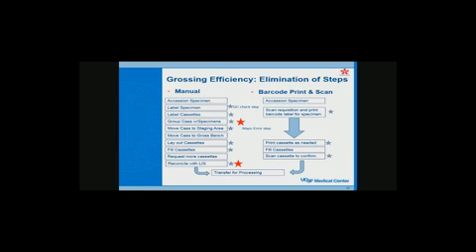This is a standard way that a lot of laboratories work because they may not have, say, a cassette printer at their bench. They have a centralized cassette printer, so they have to print the cassette somewhere else, stick it with the specimen, then they have to move that whole thing around. And so that can lead to some problems. So what we're doing with barcoding is ideally printing the cassette at the grossing bench, rather than in a central location. In that way, we eliminate that whole batch process of printing, and we print the cassette only as it's needed. It eliminates several steps in the process.